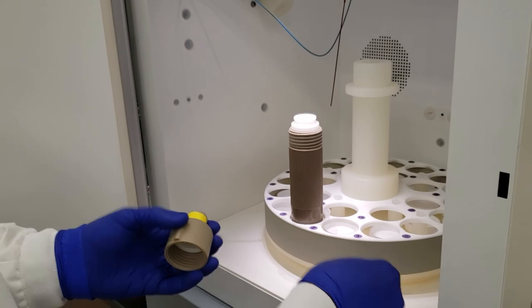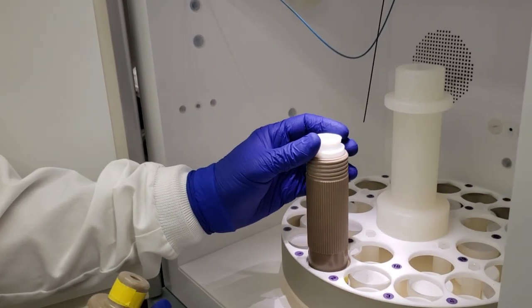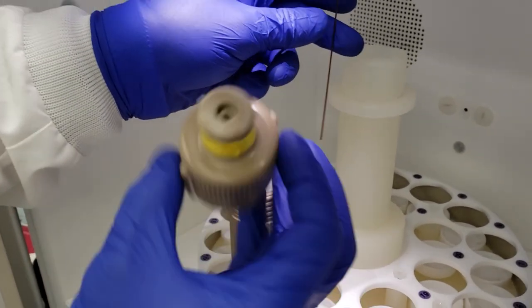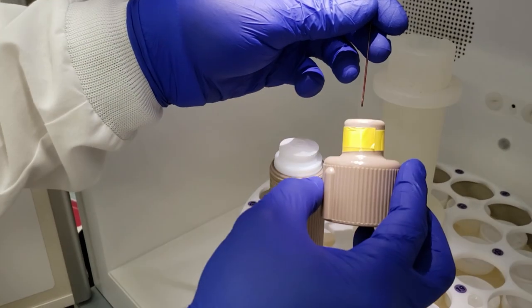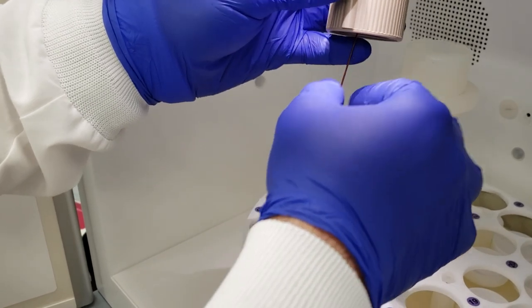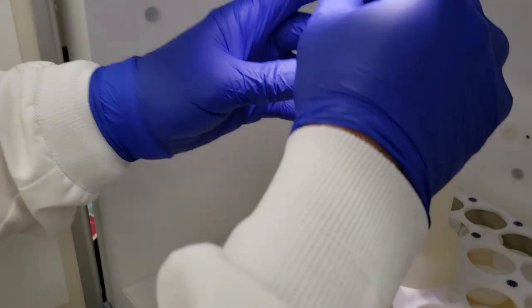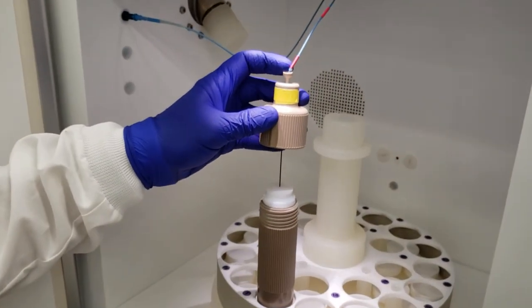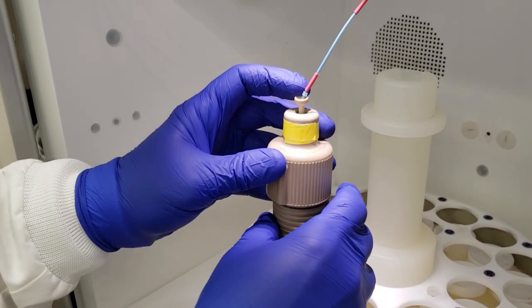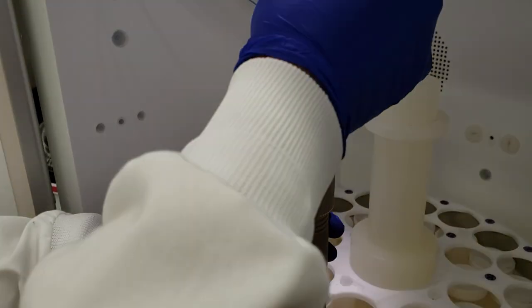And we're going to go ahead and set up our temperature probe. I'm going to place that Teflon wafer right on top of my reaction vessel. We have a pass-through hole on our cap, so I'm going to place my temperature probe through the center, and then down into the thermal well. You see that okay? So down inside the thermal well in the center of our reaction vessel. I'll gently place that shield. It did pop up. I'll place that back in just a moment. There we go.